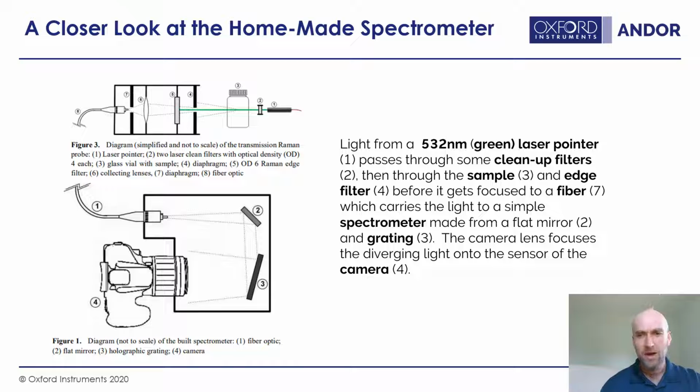Not to denigrate their work here, it's awesome. This is such a cool project. But it's meant, for us, for looking at a specific band of wavelengths, and you can't change the color or look somewhere else. So just to contrast it with the sort of research equipment you might see in a lab.